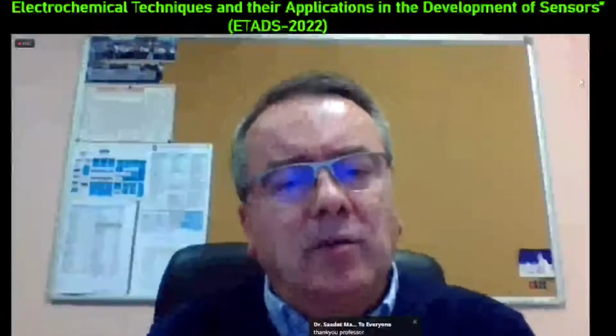Yeah, paraquat was used as an analyte. So paraquat is positively charged, so it could interact with the negatively charged silica surface, and it could accumulate. And actually, not only the charge is likely to affect these accumulation processes, but when you have some aromatic group, which is the case of paraquat, the efficiency of the accumulation is much better.